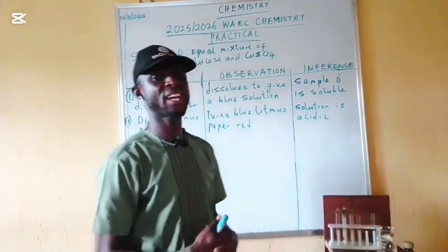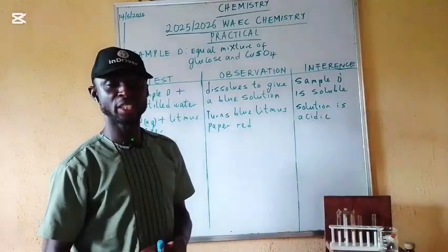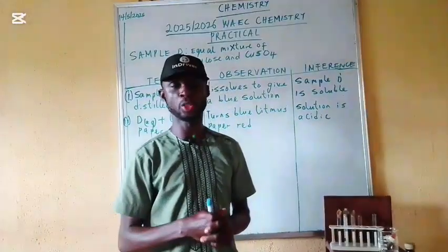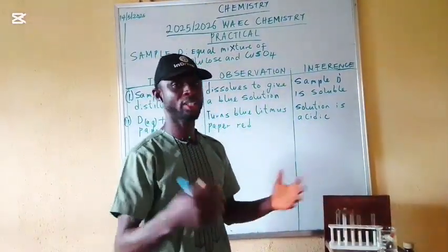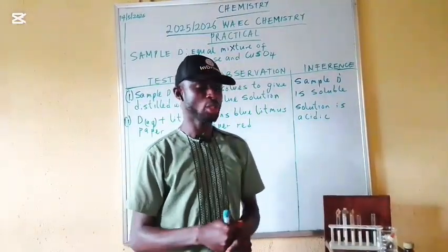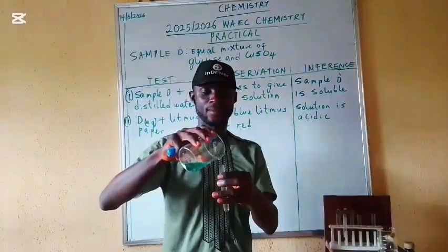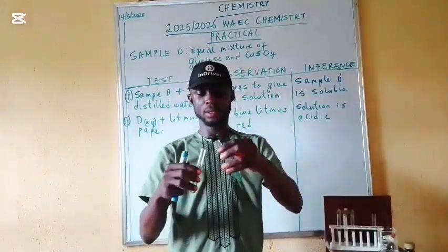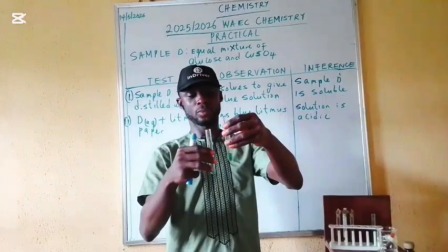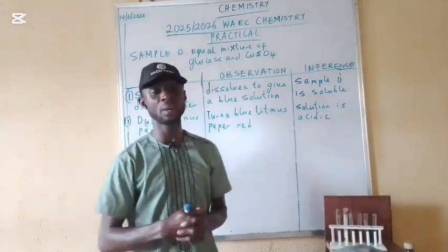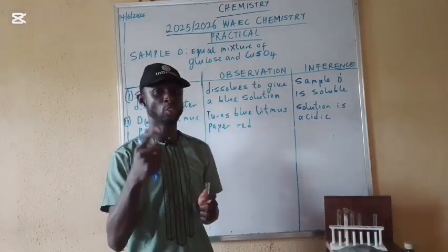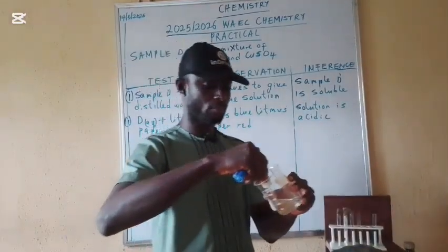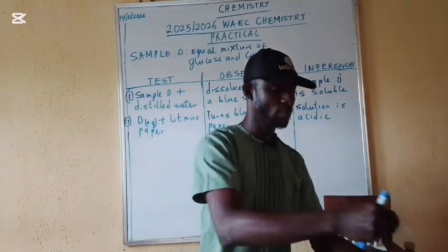Now the next likely question they may ask us is to divide our sample solution into two portions. From our two portions, we can add other reagents to test the sample. So let's divide our sample into two portions. Let's add sodium hydroxide in drops to our first portion and look at the observation.